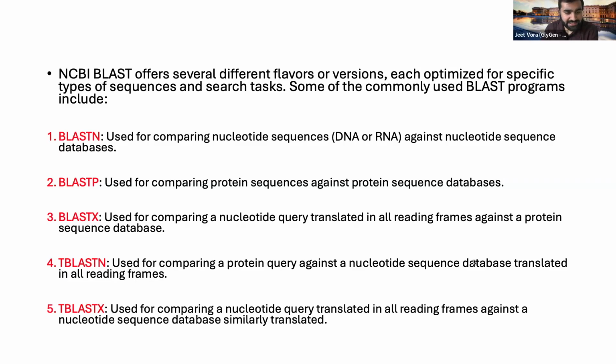BLAST-X is used to compare your nucleotide query sequence against a protein sequence database, and TBLAST-N is used to query your protein sequence against a nucleotide sequence database. The other one is TBLAST-X, which compares a nucleotide sequence translated in all reading frames against a nucleotide sequence database translated in all reading frames. So these are a few flavors of BLAST. And in GlyGen, we have implemented BLAST-P.